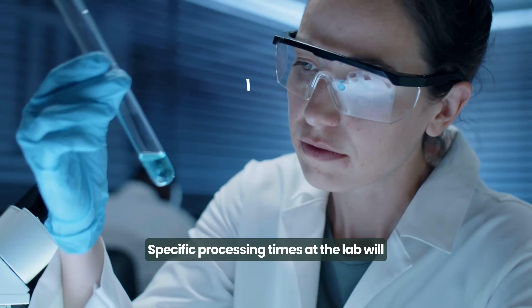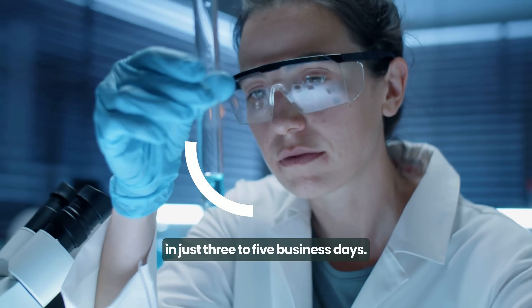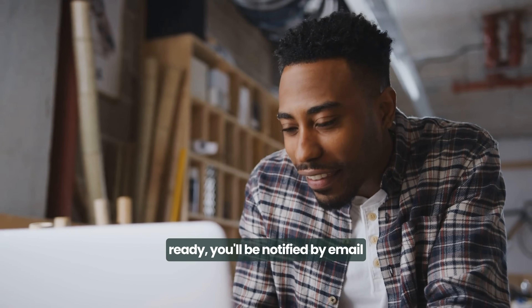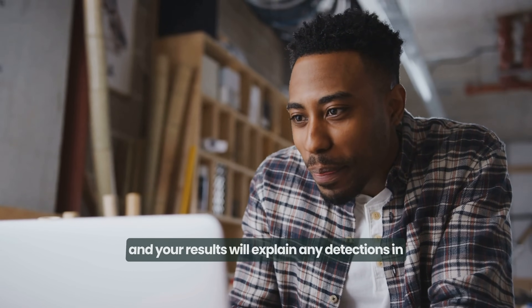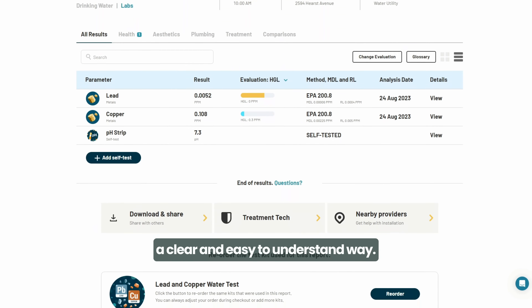Specific processing times at the lab will vary, but most results will be ready in just three to five business days. As soon as your report is ready, you'll be notified by email, and your results will explain any detections in a clear and easy to understand way.